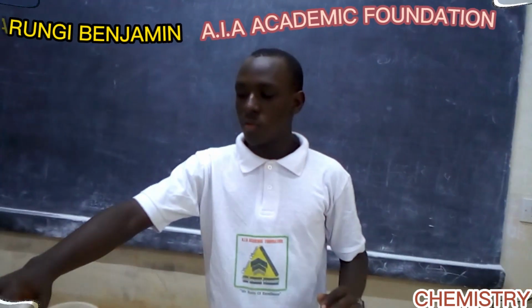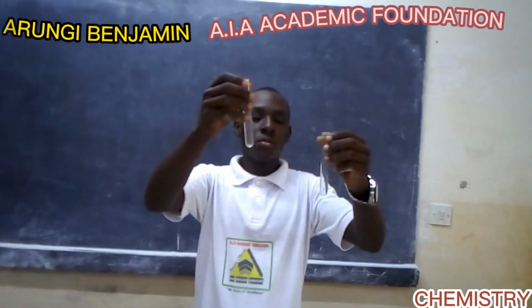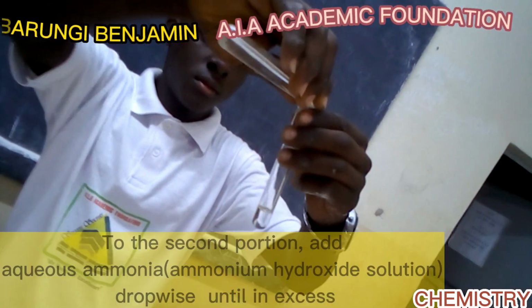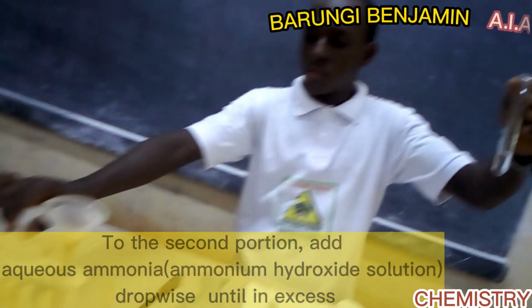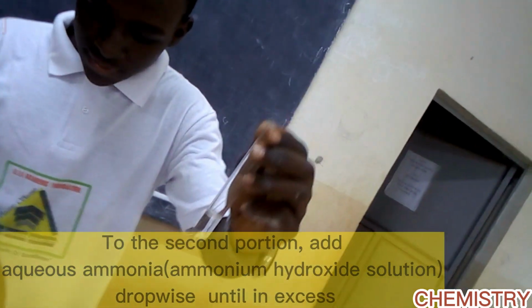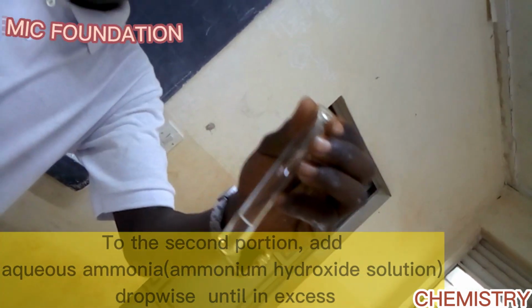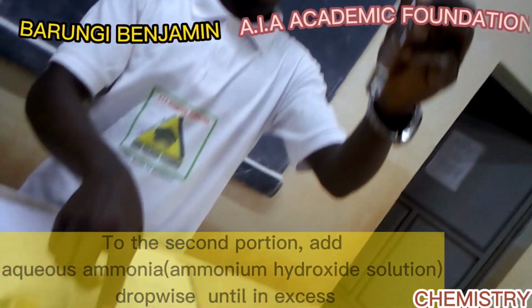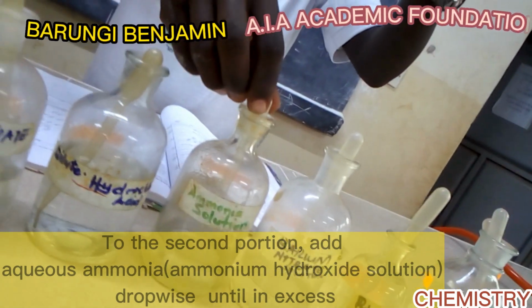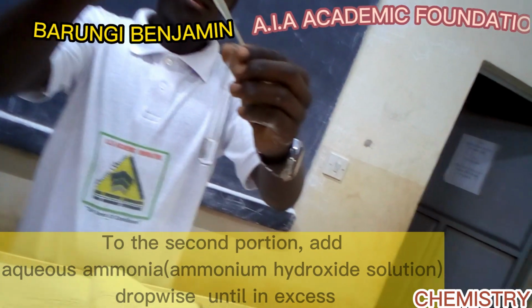Second portion. Now we are going to get the second portion. You get a clean test tube and you get your solution. Yes, this is the second portion, and they have told us to add aqueous ammonia dropwise until in excess. So we are going to get our aqueous ammonia, which is this. This is our aqueous ammonia solution, or dilute ammonium hydroxide. So we are going to add it dropwise until in excess.